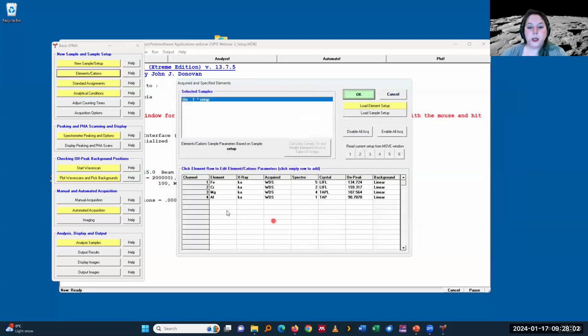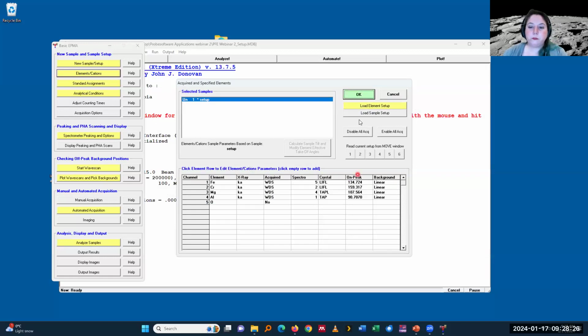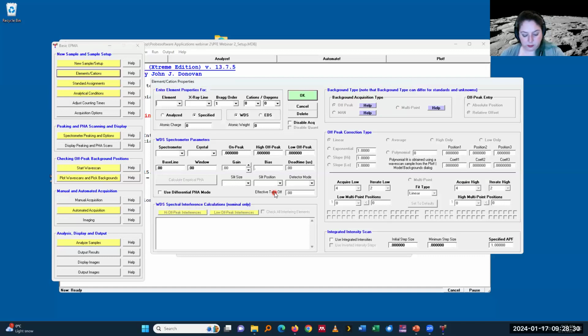And then a classic example of an element that we don't want to analyze because we know it's stoichiometric is oxygen, so we can just specify it. Other examples are carbon in carbonates. And again, otherwise I can also already put in the EDS, because you can do integrated EDS, WDS analysis in the software. So this would be, oh yeah, and titanium. Classic example.